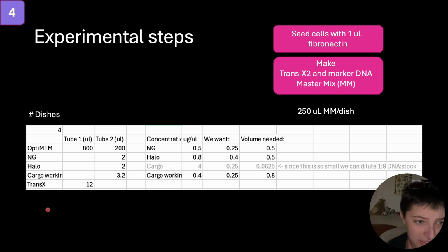So we used a transmembrane trans-Golgi marker, and also the ES cargo marker, and we also used Halo as a marker for ER exit sites, but those aren't as important to answering the hypothesis as the other two.